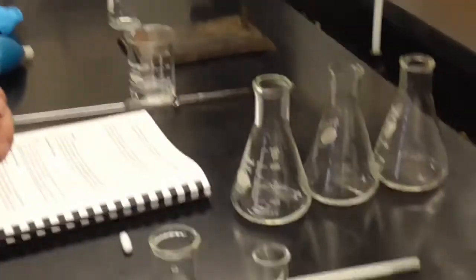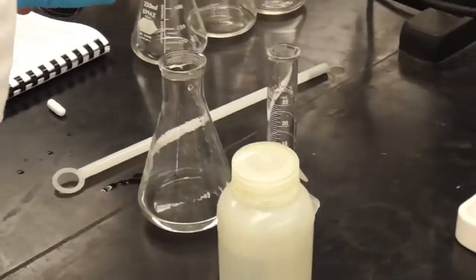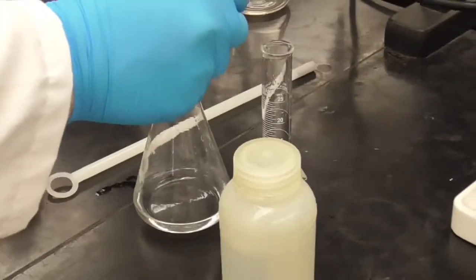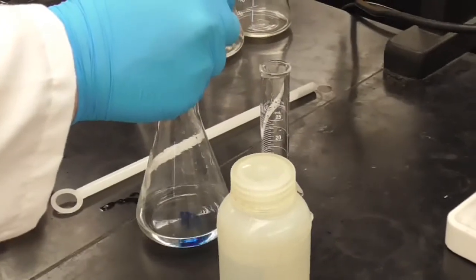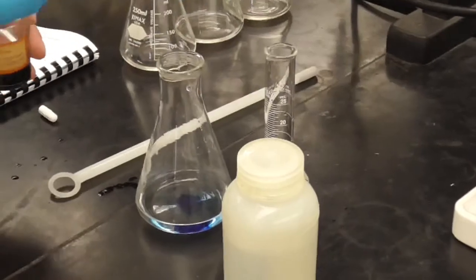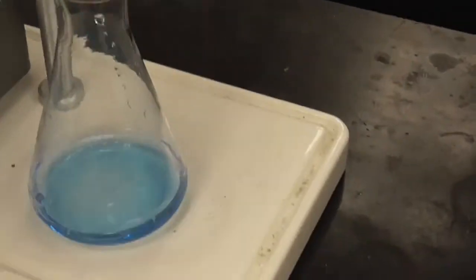We're going to add, it says, a few drops of bromothymol blue indicator. So how many do we want to do? Let's say about 5 maybe. 1, 2, 3, 4, 5. Okay, for the first one. And so we have a white background here. You can see that.